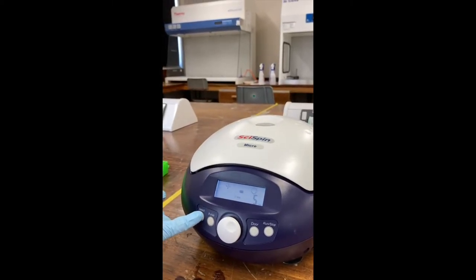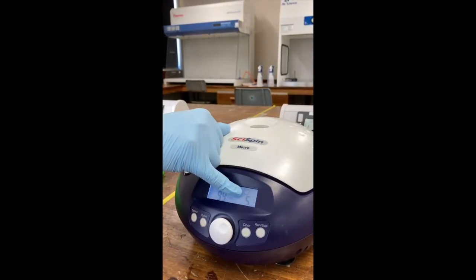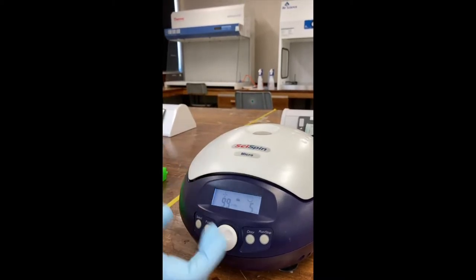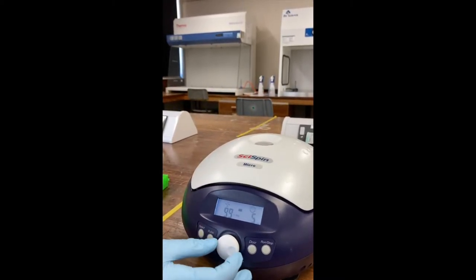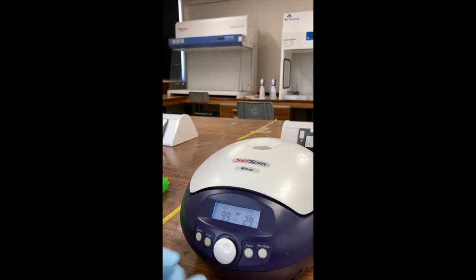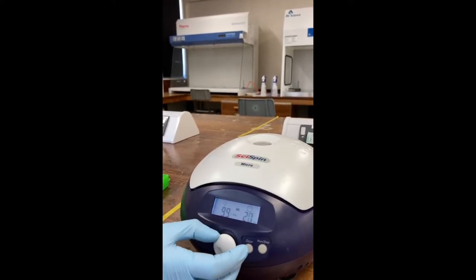The next thing you can change is the time in minutes. So we'll set it to 10 for an example. You use the dial there to just change the setting that you want.